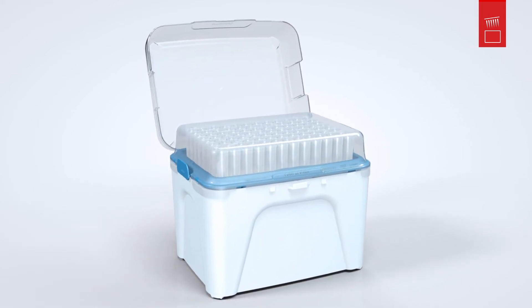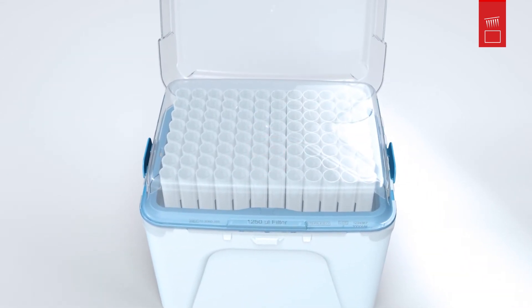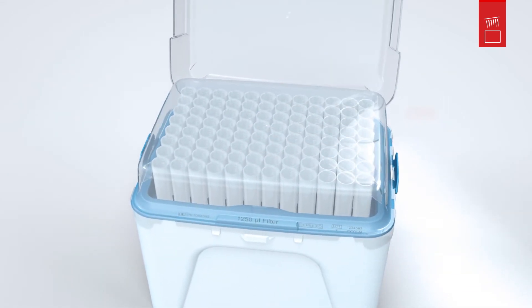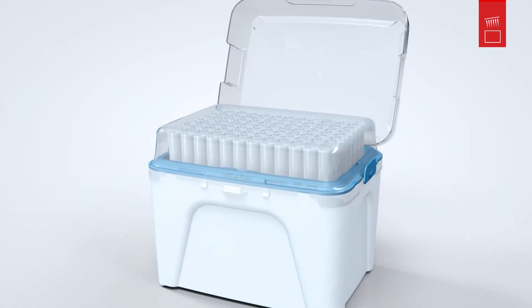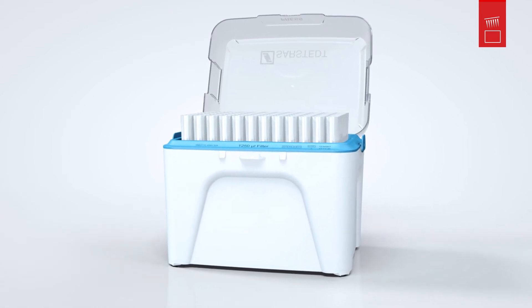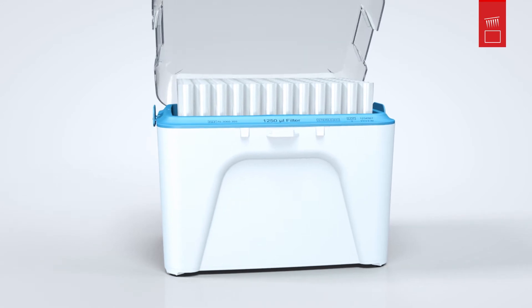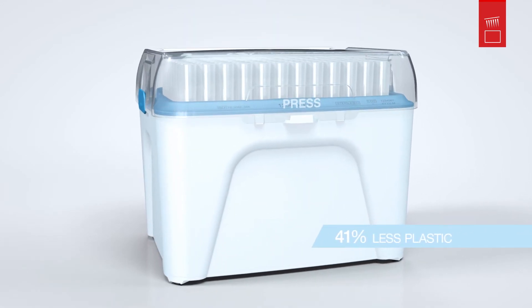With a light touch on the middle of the lid, the single refill engages with an audible click. You can then easily remove the lid from above. Now you have a newly loaded ultra-pure tip box within a few seconds and avoid up to 41% of the waste in the process.